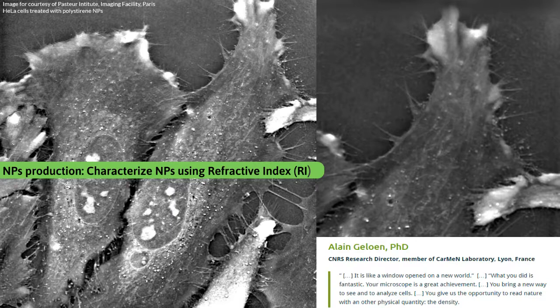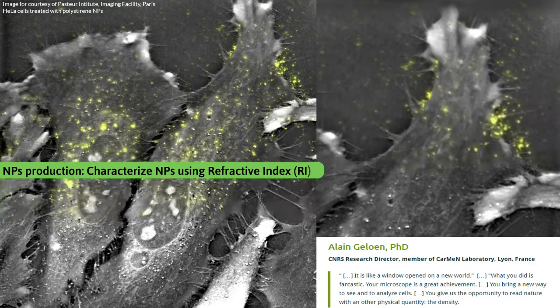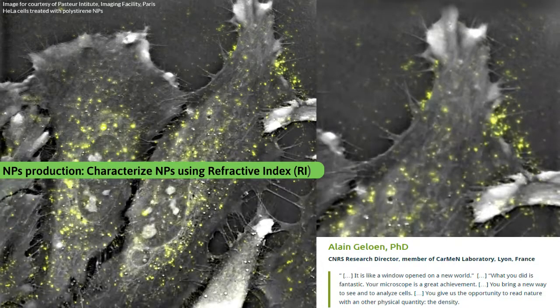But again, you can still have some doubts, but as soon as you start to do the correlation with fluorescence, the interpretation of holography becomes so clear that we can replace fluorescence in order to see them. We don't need fluorescence, but of course, a multimodal approach can be absolutely beneficial.